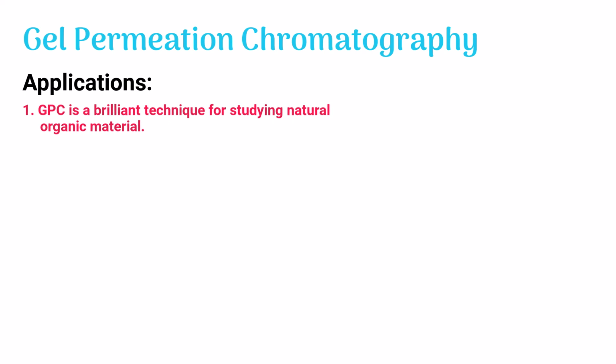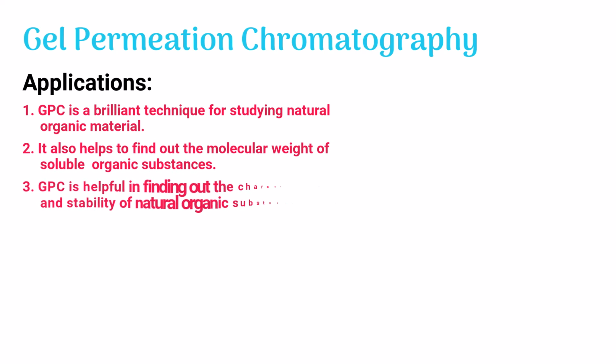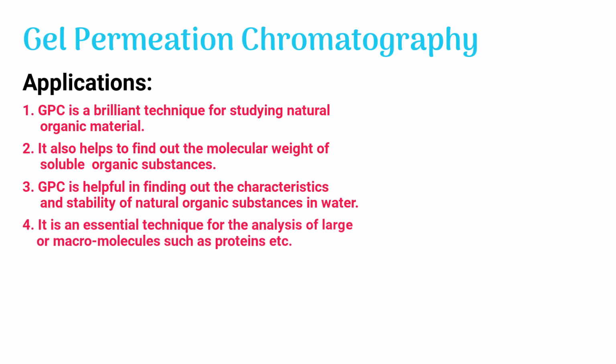Applications of gel permeation chromatography. Gel permeation chromatography is a brilliant technique for studying natural organic material. It also helps to find out the molecular weight of soluble organic substances. Gel permeation chromatography is helpful in finding out the characteristics and stability of natural organic substances in water. It is an essential technique for the analysis of large molecules or macromolecules such as proteins, etc.